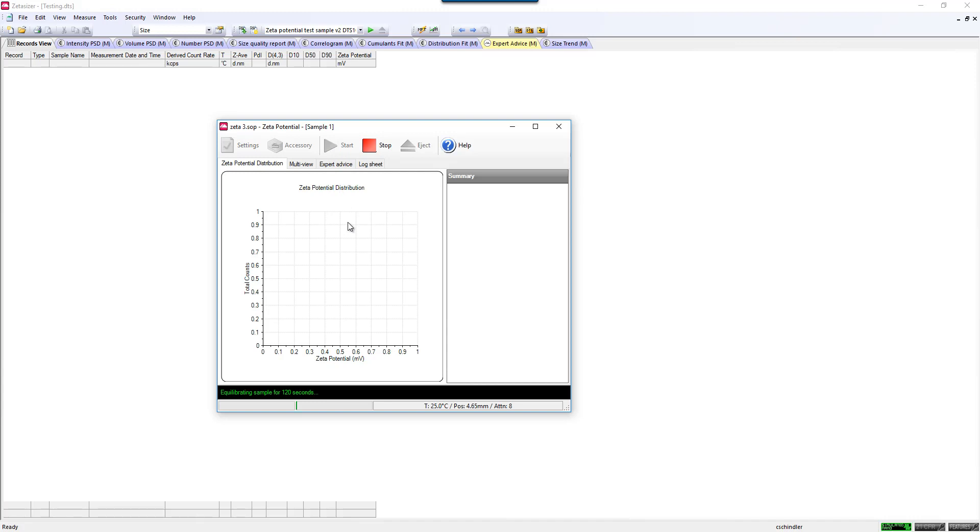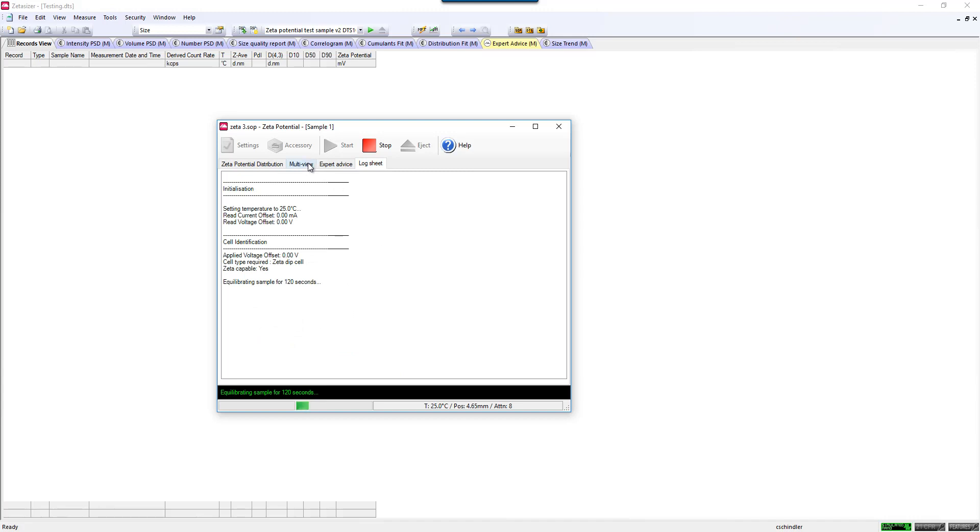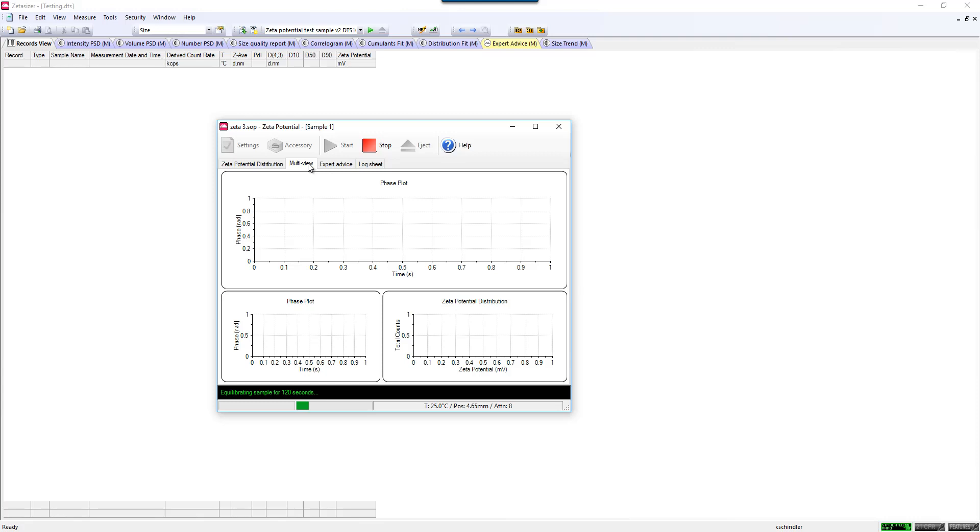You can watch what happens during the course of the SOP in the green text in the bottom of the window, which will show which stage you are within your SOP. You can follow this also on the log sheet, which gives you more detailed information into the optimization processes of the system. Once you are finished, you will see a record populate in your record view where you can view the data.